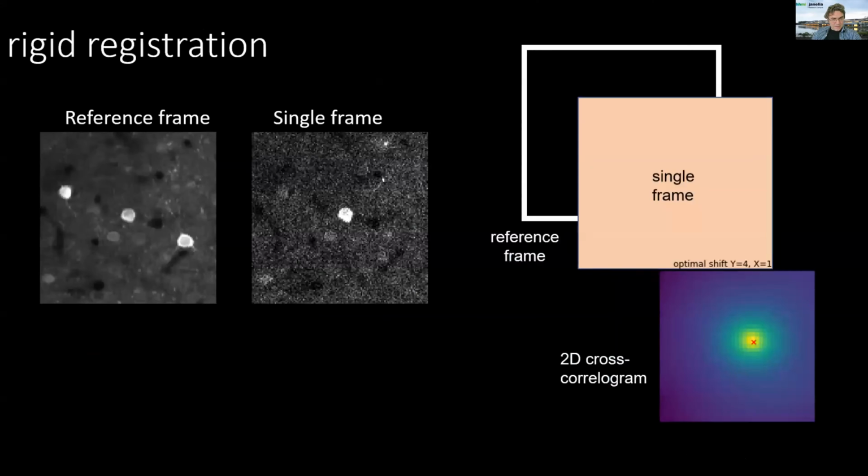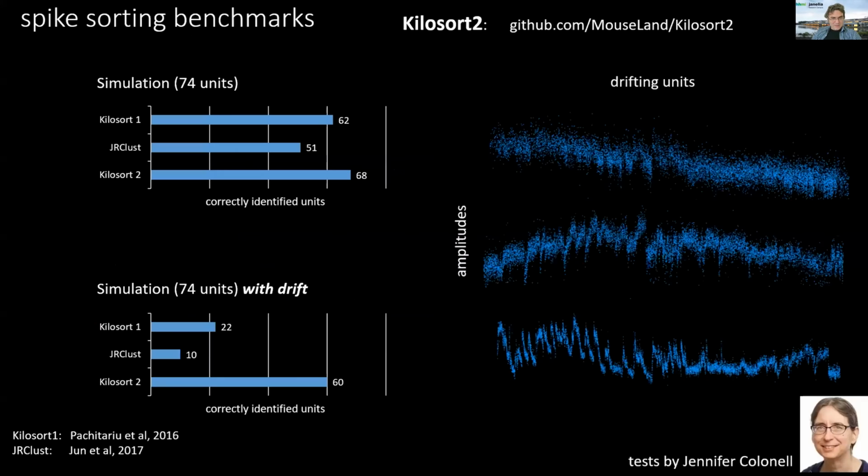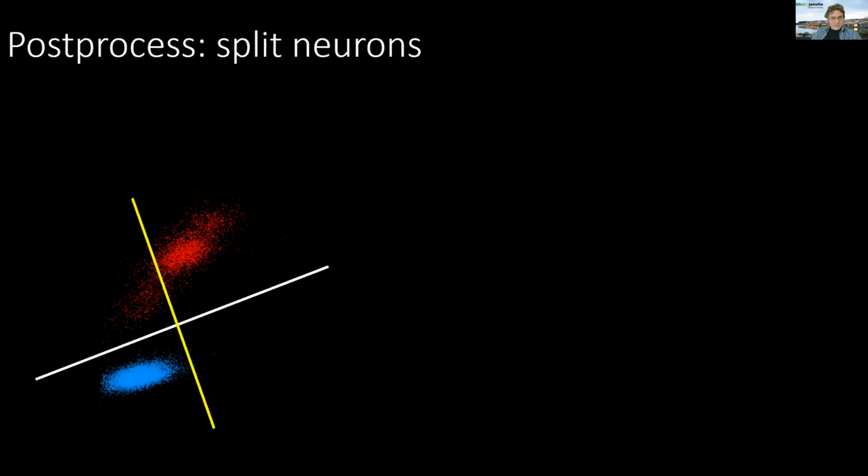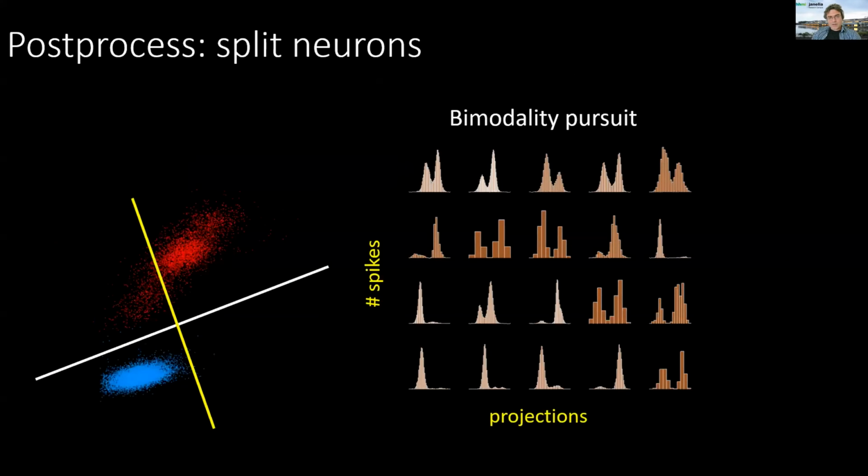let me find the plot that I need to show you this. Essentially, this plot. Okay, so in the past, people have used other more complicated clustering algorithms, but we've been sticking with k-means all the way up until even version 2.5. The reason for that is that the output of k-means is nicely interpretable, because all it does is split the data.